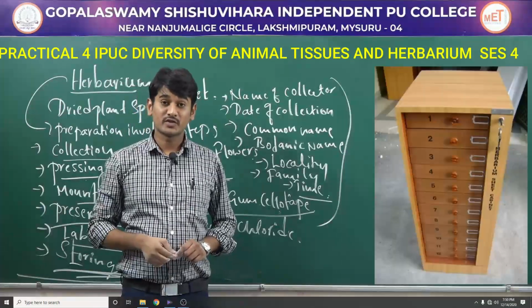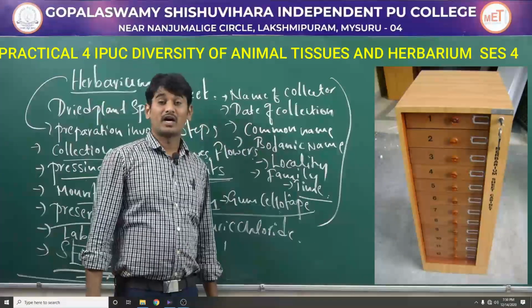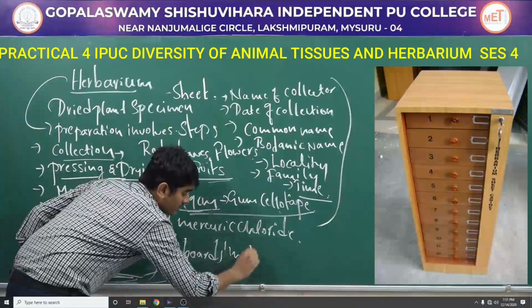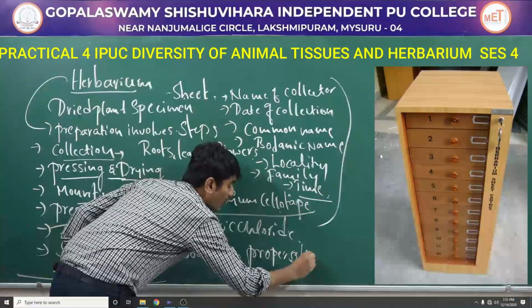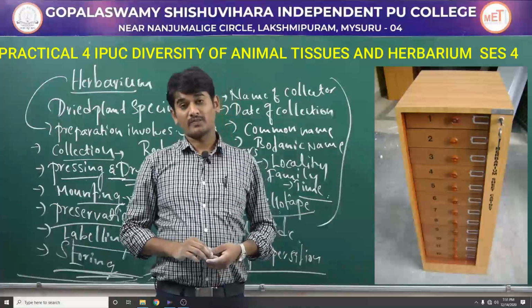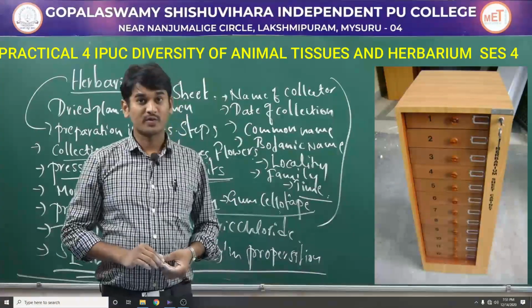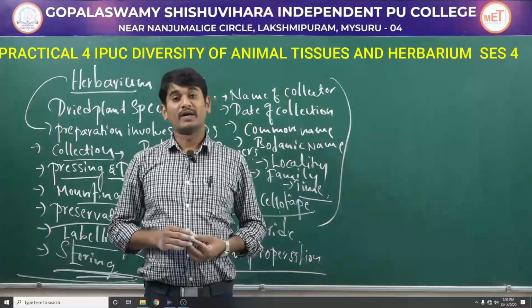The final step is storage. After labeling, the labeled herbarium is stored in cupboards in proper position according to a well-known system of classification. These are all about storage. So these are all the steps involved in the preparation of herbarium.